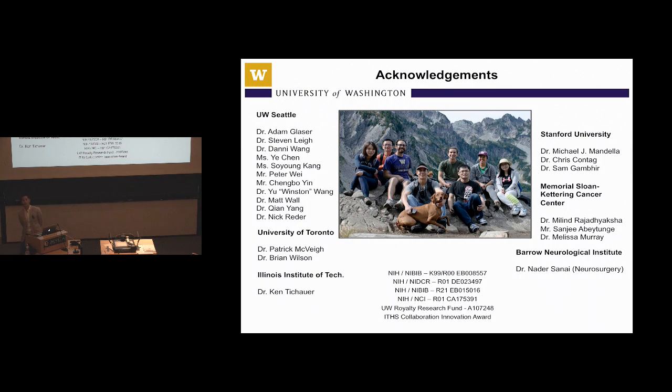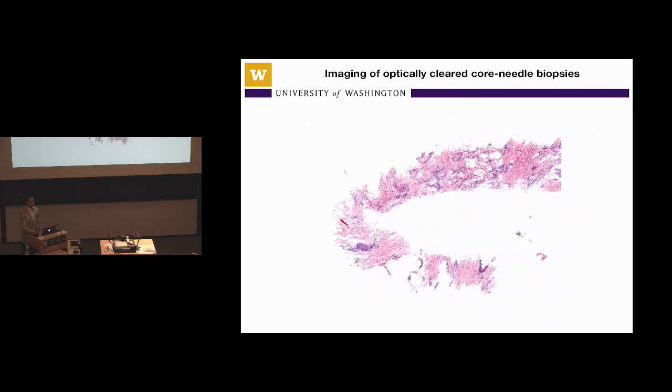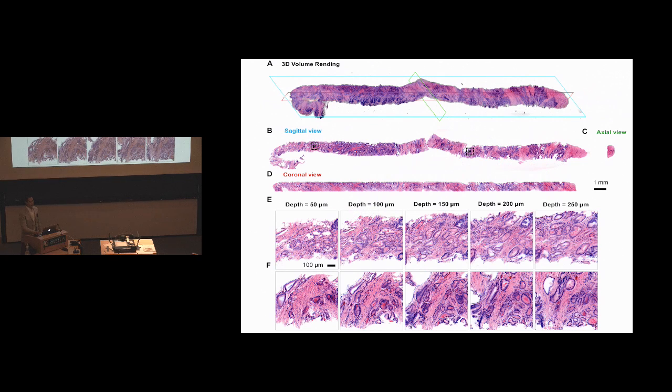So co-registering, are you talking about the 3D microscopy? Yeah, like you saw that video where you essentially pause at one slice and you can translate that back to one particular section that you might have taken afterwards and leave it as your 2D. So for example, with this core biopsy, figuring out at what plane, or in the bulk specimen, figuring out where it came from or where the tumor was located.